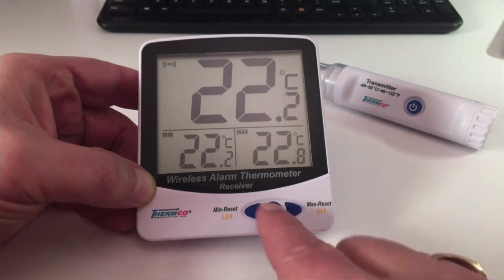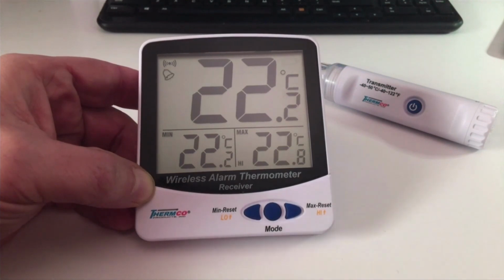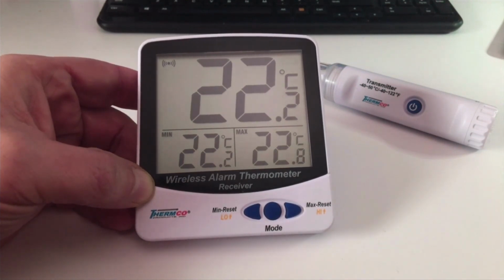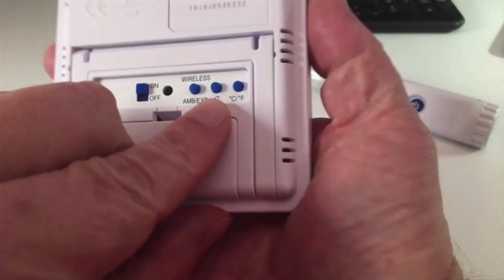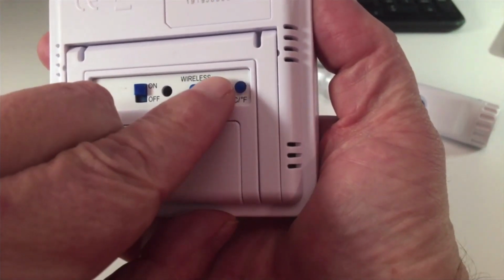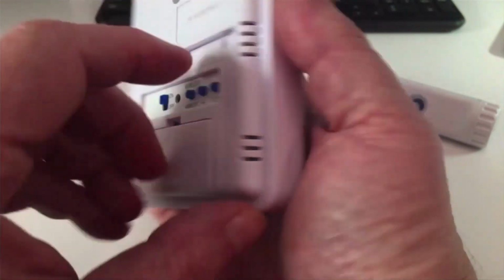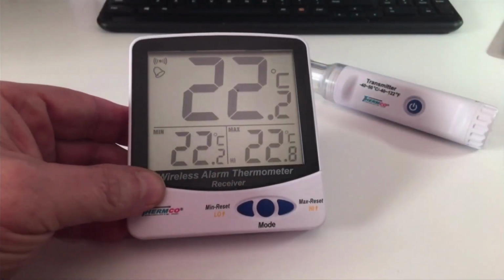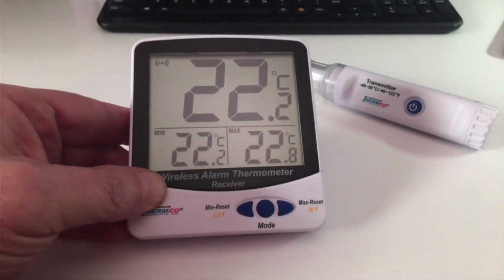Okay, press the mode button again. We're all set. It's now time to put the sensor into your storage unit and let it stabilize the temperature over approximately 30 minutes. And once it's done that, then go to the back of the unit, deactivate the alarm and reactivate the alarm, and you'll be good to go. Now, we're still in alarm conditions, but normally you will not have any alarms until you have an excursion, go outside those parameters that you just set.